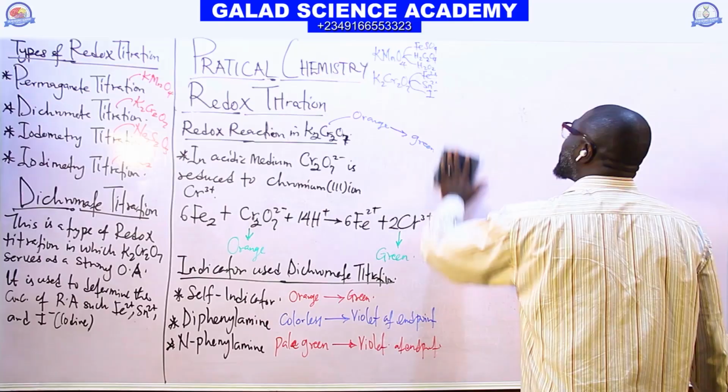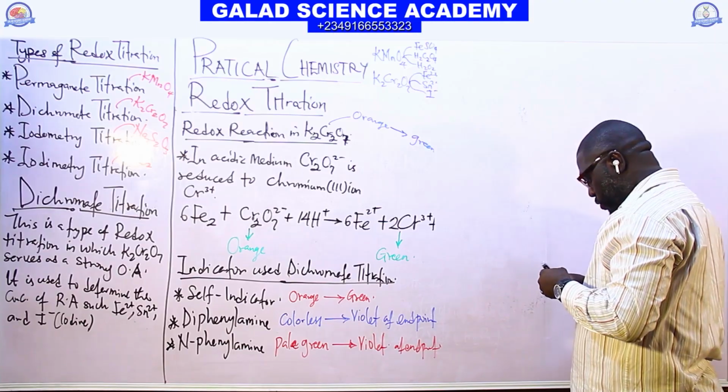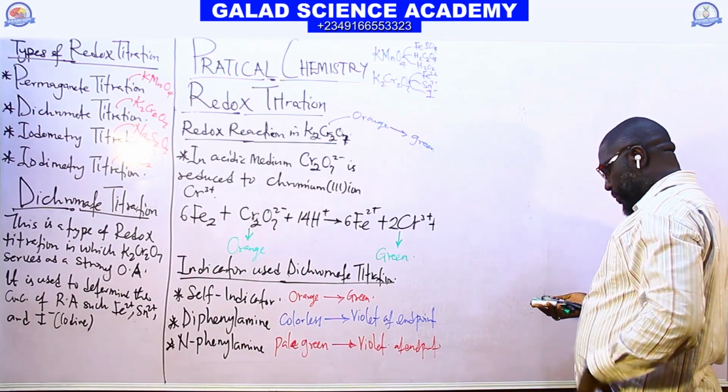And the next one is iodometric titration. Let's treat iodometric titration.